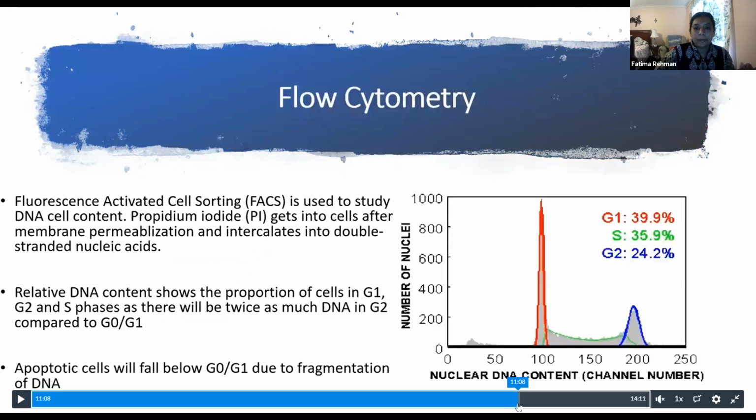The next thing that I will show you is another thing that we will work with later in the semester, but I wanted to show you this data now because many of your primary literature articles that you will see in between do have this data. So this technique is called fluorescence activated cell sorting, or fluorescent assisted cell sorting, or FACS analysis for short. FACS cell cycle analysis looks at not the health of the cell so much as the state of the cell in the cell cycle.